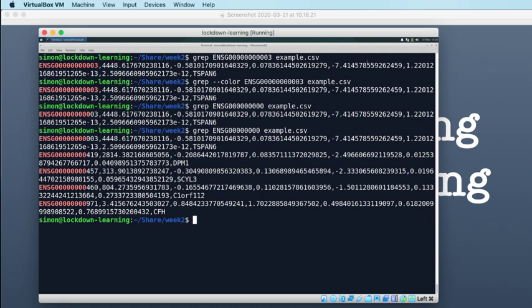So there you go. Of the 1,000 possible results that would have 8 leading zeros, those are the ones that we can find in this file. And if I removed another 0, I would get more results. In this case, we can see we've got 1, 2, 3, 4, 5 genes which match that particular pattern.